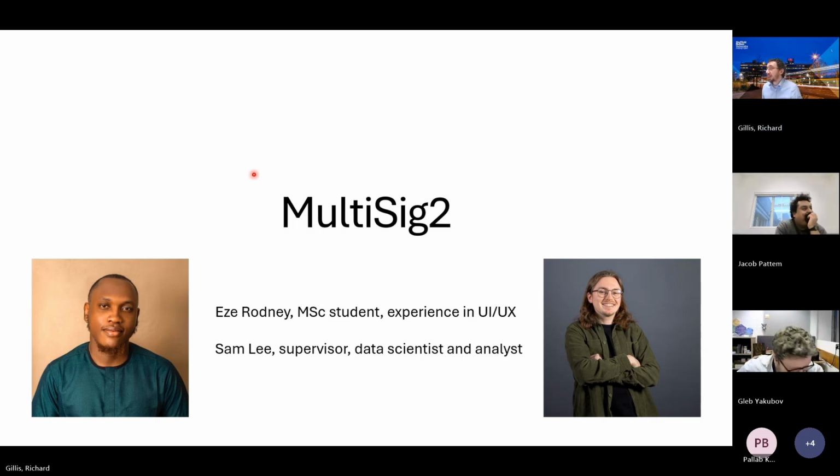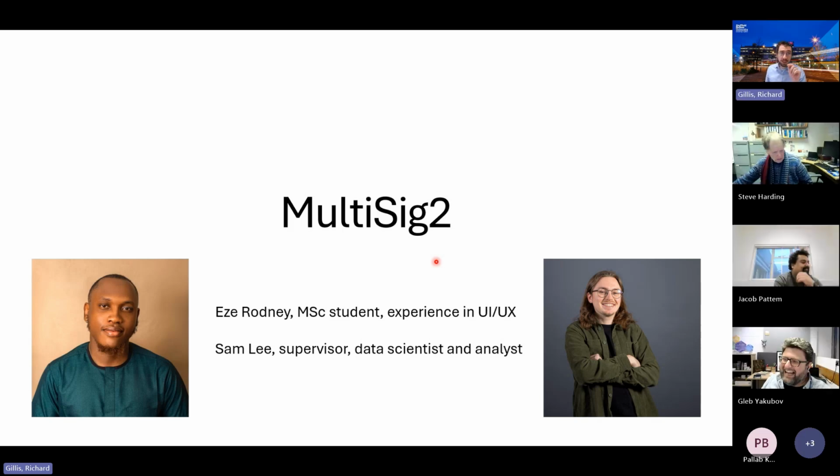Rodney is an expert in user interface and user experience. So I showed him lots of different types of software which our community uses. I showed him SedFit, and I said, I like SedFit for this, I hate SedFit for this. I showed him UltraScan. I showed him SedInterp. I showed him SedAnal. And I said, stop laughing, it's called SedAnal, and ignore the fact that the help thing is the developer's dog. So I said, this is the level at which we're aiming, okay? And he was like, yeah, I can do better than that.